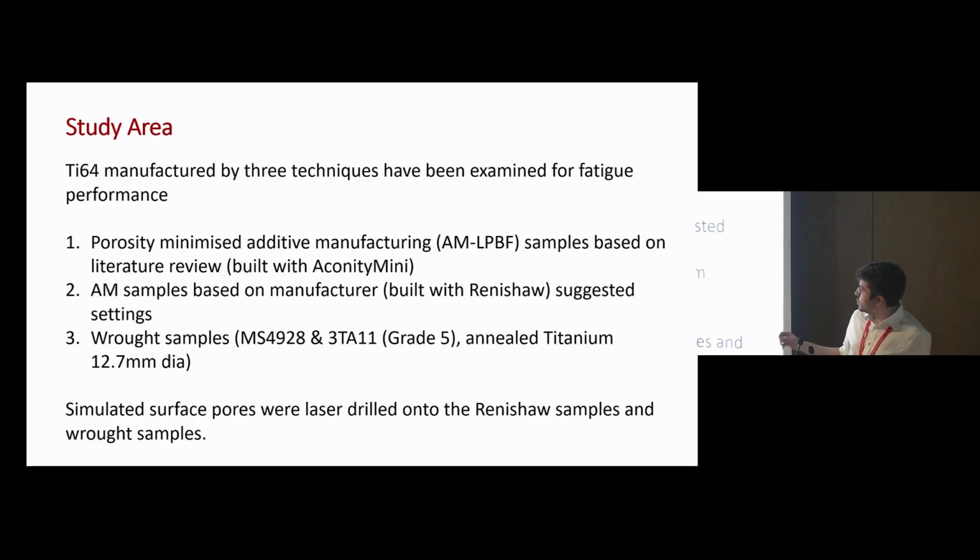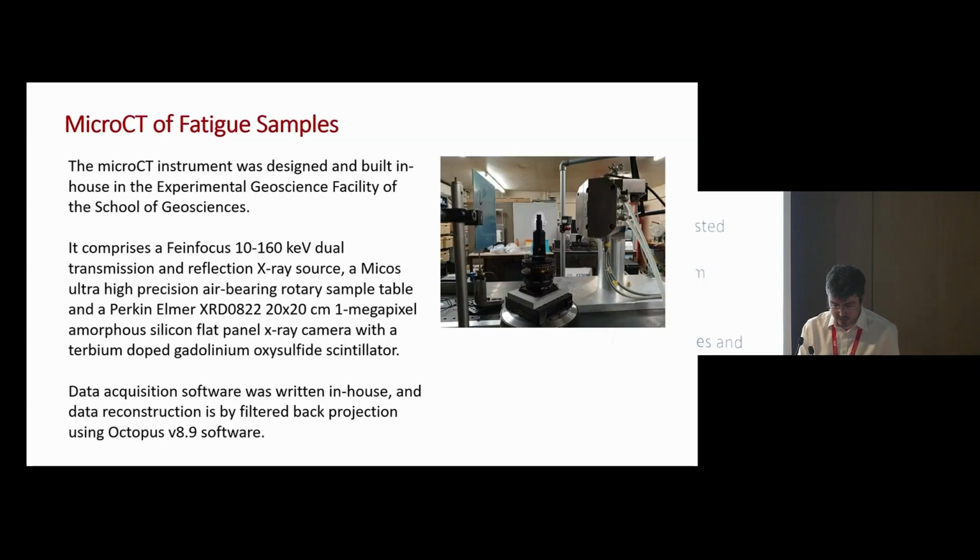At the bottom, to also help prediction, I have lasered holes into some of the samples to help me predict fatigue. So, just a quick little slide on the CT used. It's the School of Geosciences one, and it's actually a home-built one.